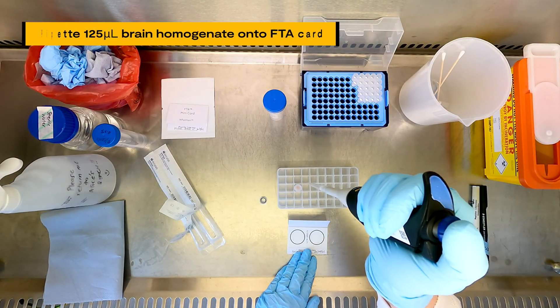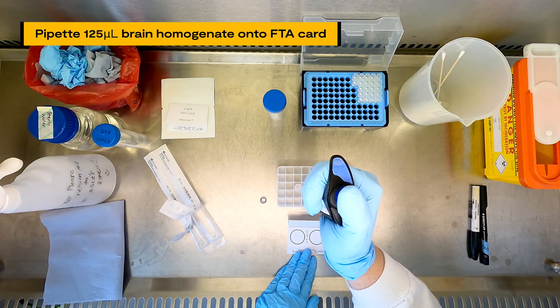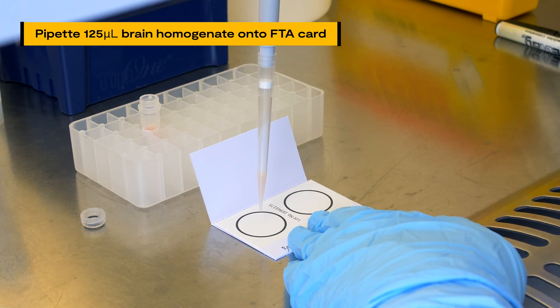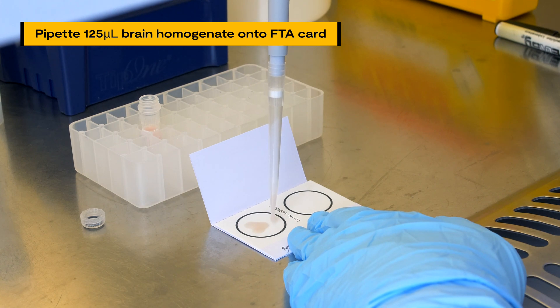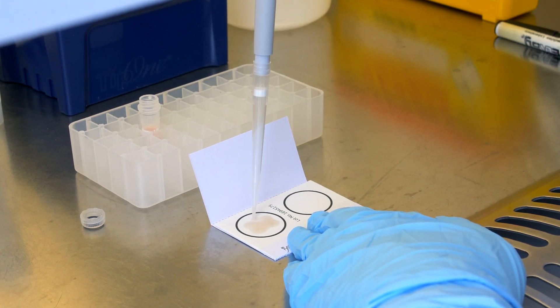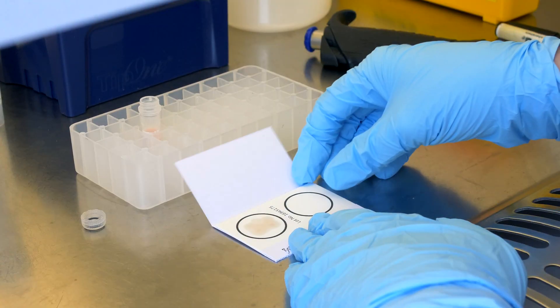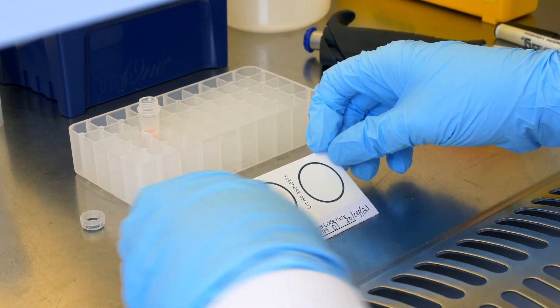Next, use a micro pipette to slowly prepare approximately 125 microliters of sample and drop the liquid in a concentric circular motion onto the pre-labeled FTA card, taking care to avoid puddles and liquid seeping through onto the back of the card. Once the tissue sample makes contact with the FTA card, the filter paper lyses cell membranes and denatures proteins but protects nucleic acids from degradation.